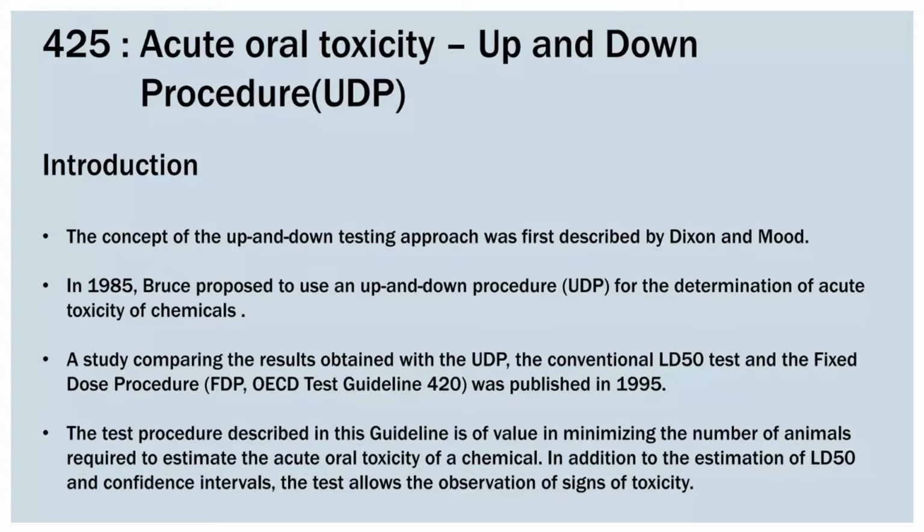Actually, the main purpose of conducting this experiment, OECD 425, is to categorize the chemicals or products, whatever is available, by calculation of LD50 and reducing the number of animals for animal welfare purposes. By this method, we can use the lowest number of animals. Even in 423, we are using 3 animals per dose level, but in 425, we are using only 1.